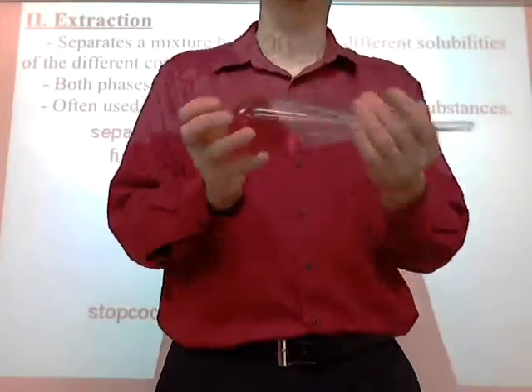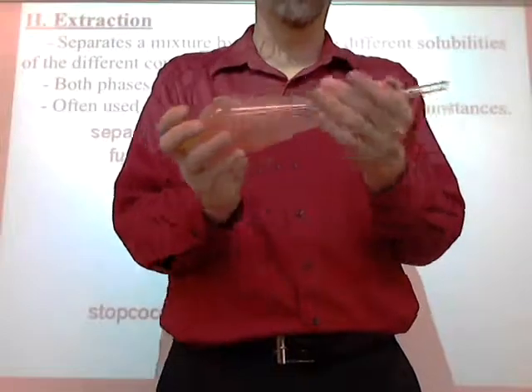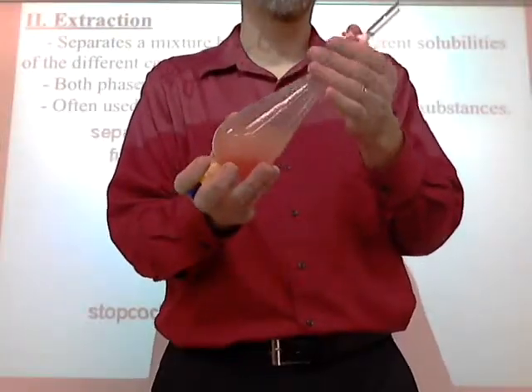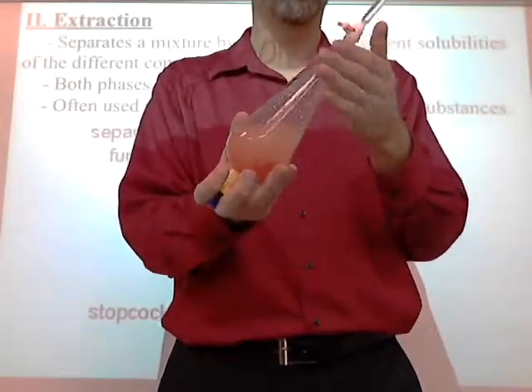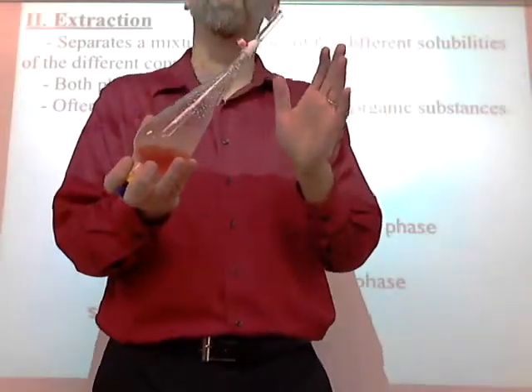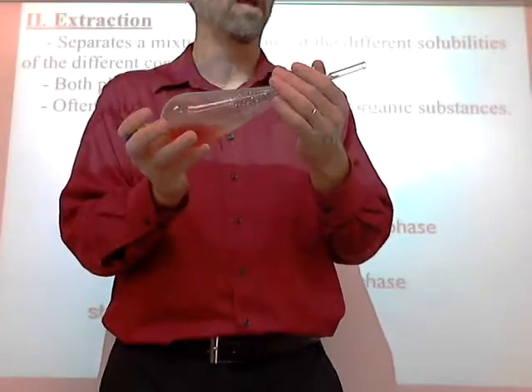Eventually, you'll shake it a little bit harder. But eventually, watch what happens to this red color when I set this back up. Venting it one more time. And you'll be doing this for about 3 or 4 minutes probably. I'm only going to do a little bit. So all you want to do is see this. Vent it. Of course, some mistakes people make. Stopcock is closed when it's like this. Okay? And it's open this way.